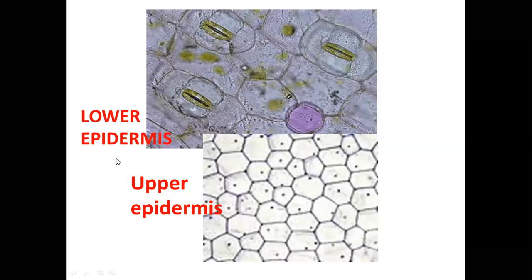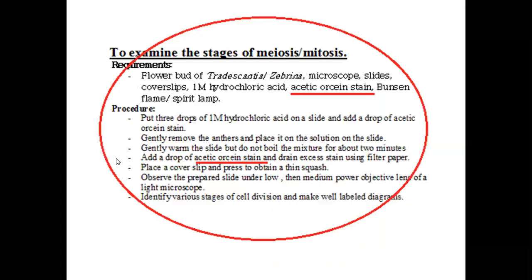So that is an area that we need to infuse even as we prepare our slides in future. Now, then another thing, and this is an area that most students again have problems. This one mainly coming from Form 3, because we can also use microscope slides to demonstrate mitosis and meiosis, or simply cell division.